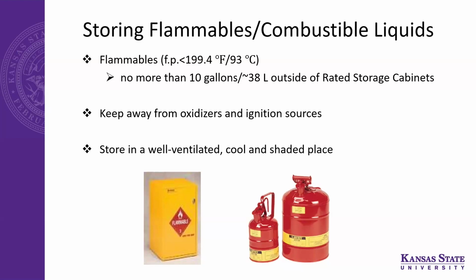So it is important to store the flammables in well-ventilated, cool and shaded places, because they can catch fire otherwise.